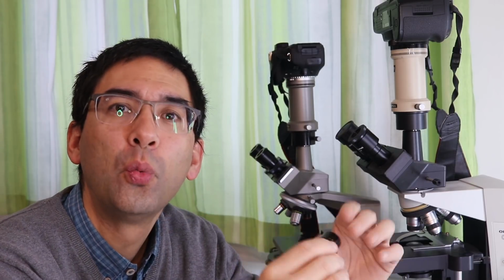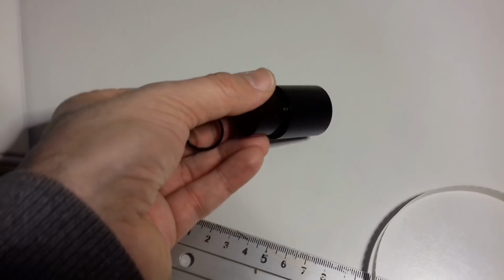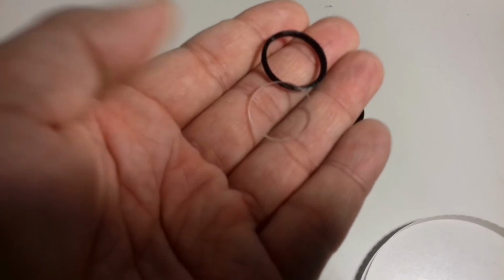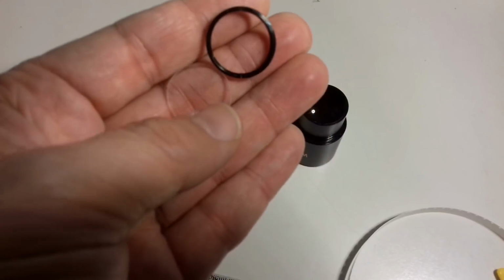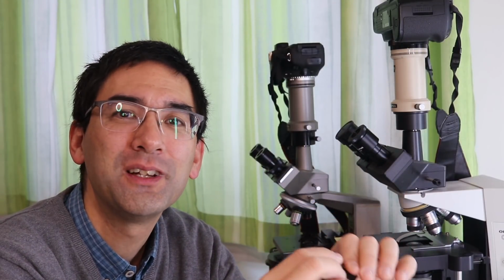This sometimes can also be an advantage if your microscope comes with an arrow. This is usually a little line that points inwards, and if you do not want to have this arrow visible, then you can always remove it by going in the back and unscrewing the eyepiece and taking it out. Okay, so that is simply a last recommendation.